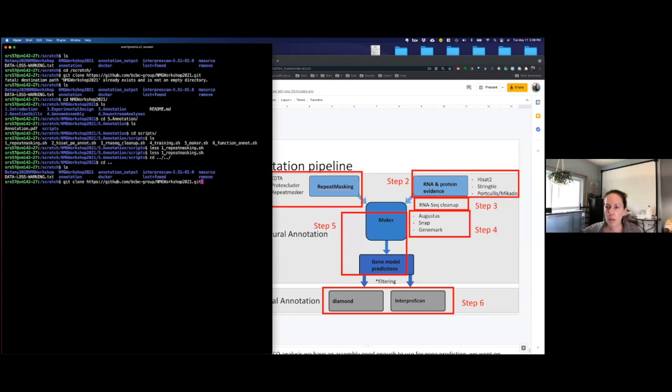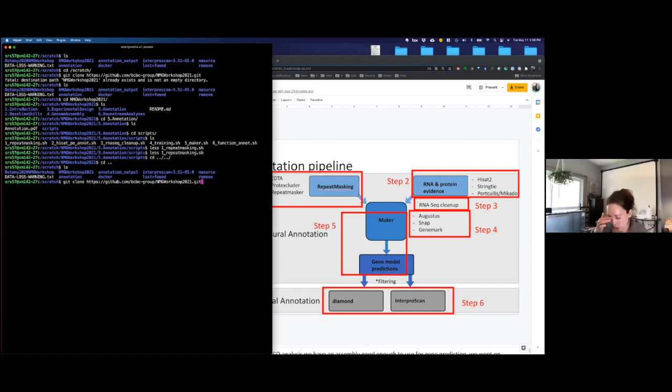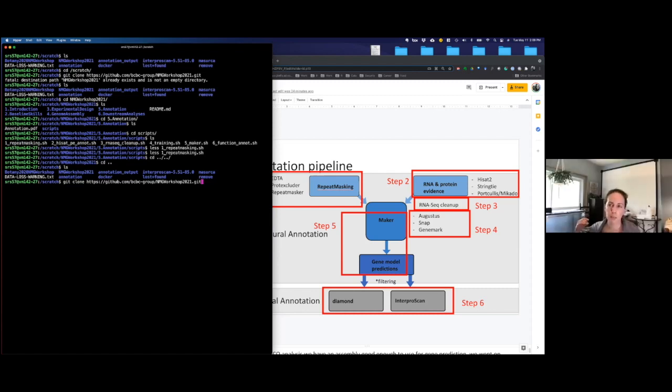You can put it in the background with Control Z and then type BG. So type Control and then the Z key. Doesn't that end it? No, that just stops it. And then when it stops it, it brings your command prompt back. So you can type BG for background, and that allows it to run in the background, but you can still type things on the command prompt.